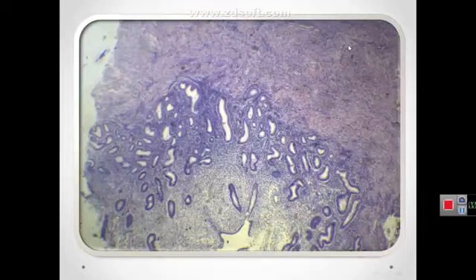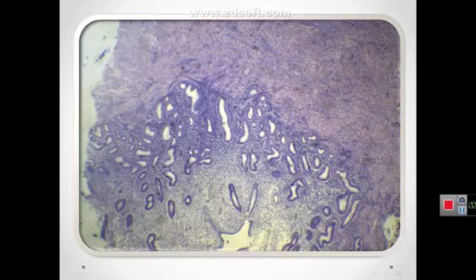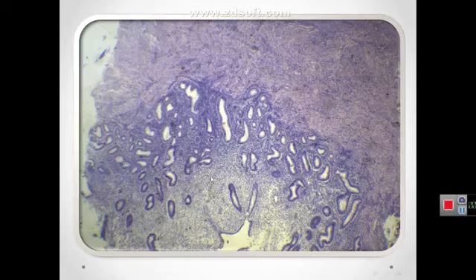The myometrium is the thickest layer of the uterus and shows bundles of smooth muscle fibers separated by connective tissue containing venous plexuses and lymphatics. The lamina propria or stroma of the endometrium contains collagen type 3 fibers with abundant fibroblasts and ground substance. The simple columnar epithelium has both ciliated and secretory cells, which also line the numerous tubular uterine glands.